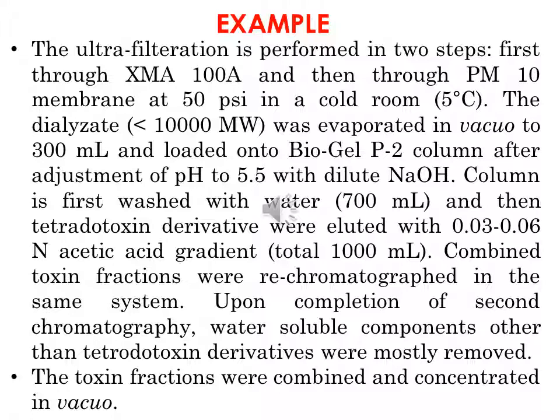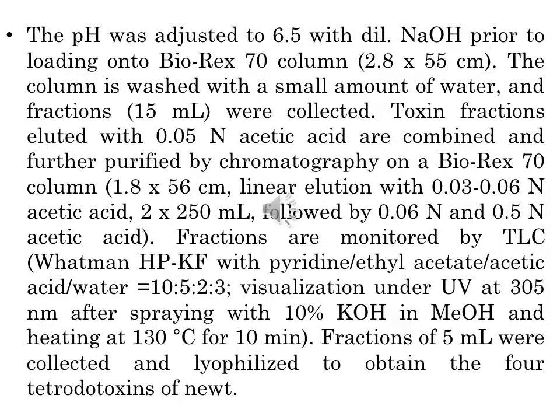Needless to say, however, the larger the pore size, the smaller the surface area, and consequently the lower the number of theoretical plates. Capping a free hydroxyl group on the silica gel helps to prevent the undesirable adsorption, and many such end-capped silicas are available. Desalting and the choice of the buffer solution.